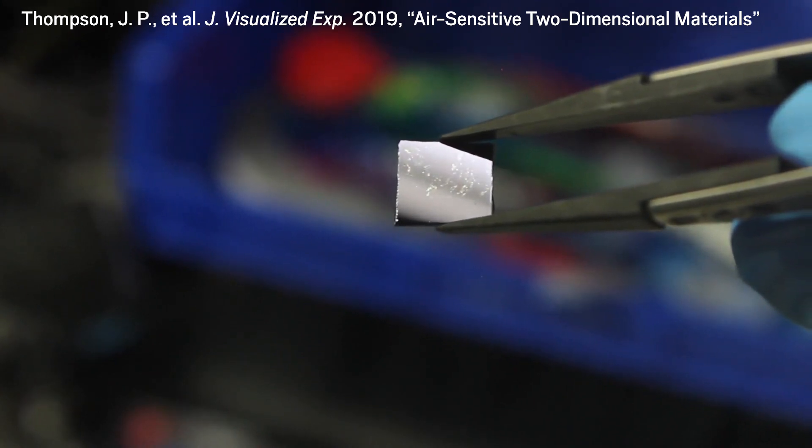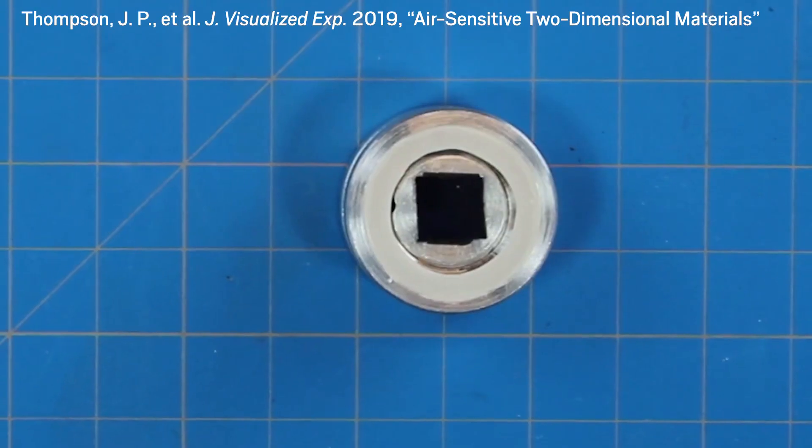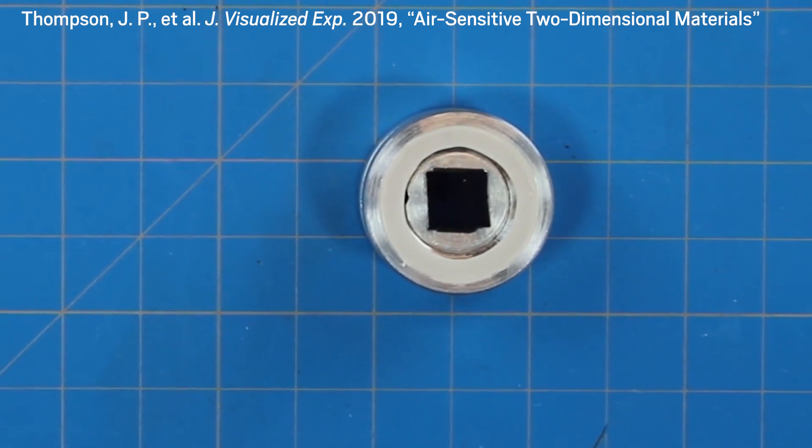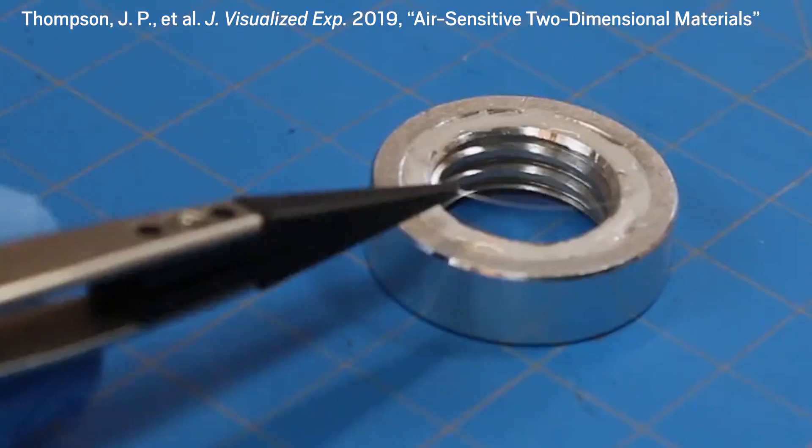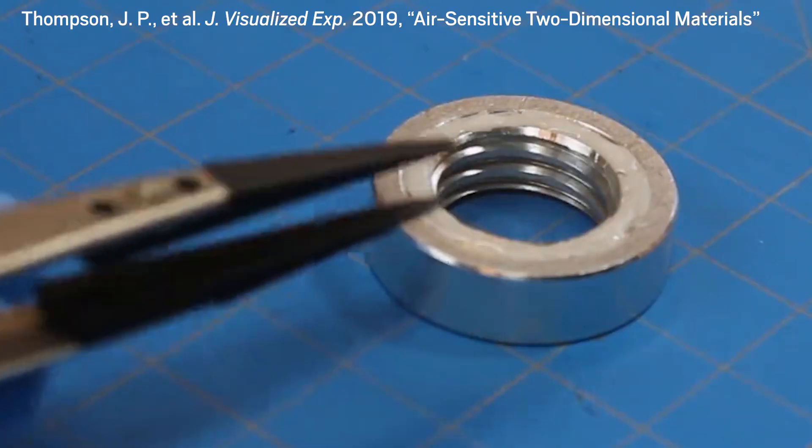Now that the Arkansas researchers have their large flakes of black phosphorus, they can add them to the airtight cell they designed. The aluminum cell has a glass window through which researchers can image the sample.